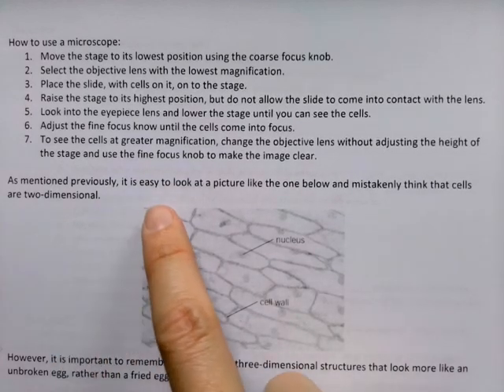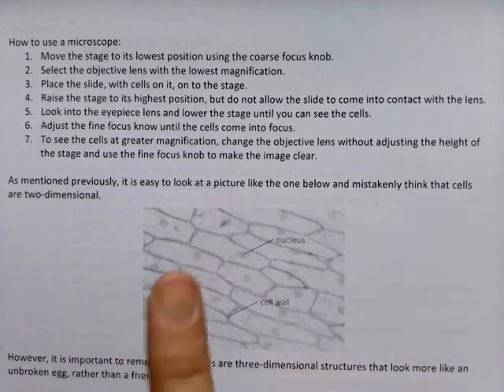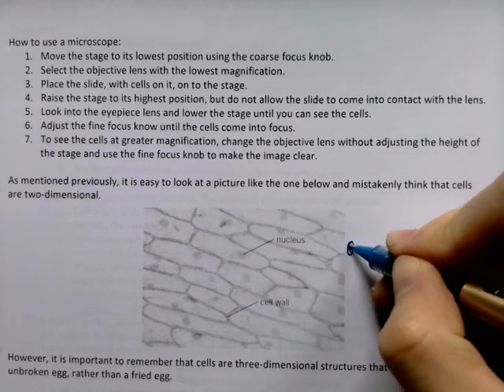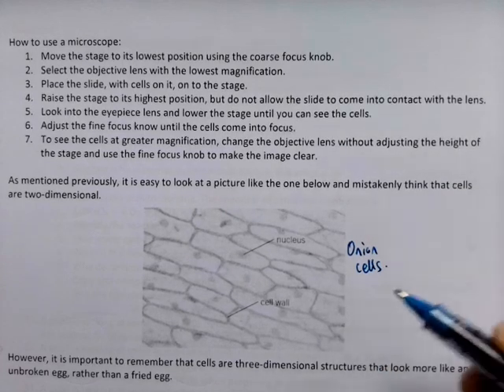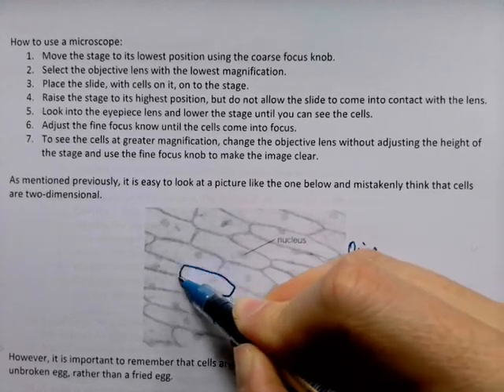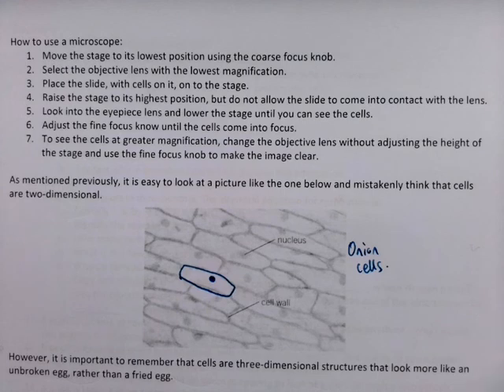Now, as previously mentioned, it is easy to look at a picture like the one below and mistakenly think that cells are two-dimensional. I got these from the textbook. These are onion cells, and this might be a practical that you'll do. Now you might think, look at them, they're flat cells with a nucleus. They're not flat. They are three-dimensional structures. It's just that because we're looking at them from one direction, they look like they're flat.